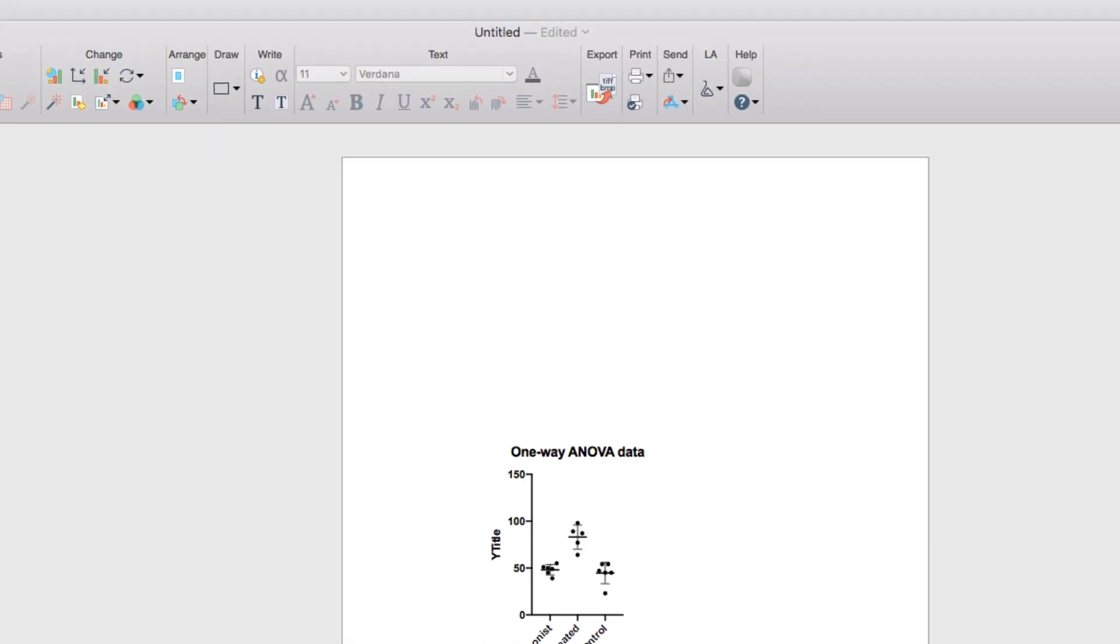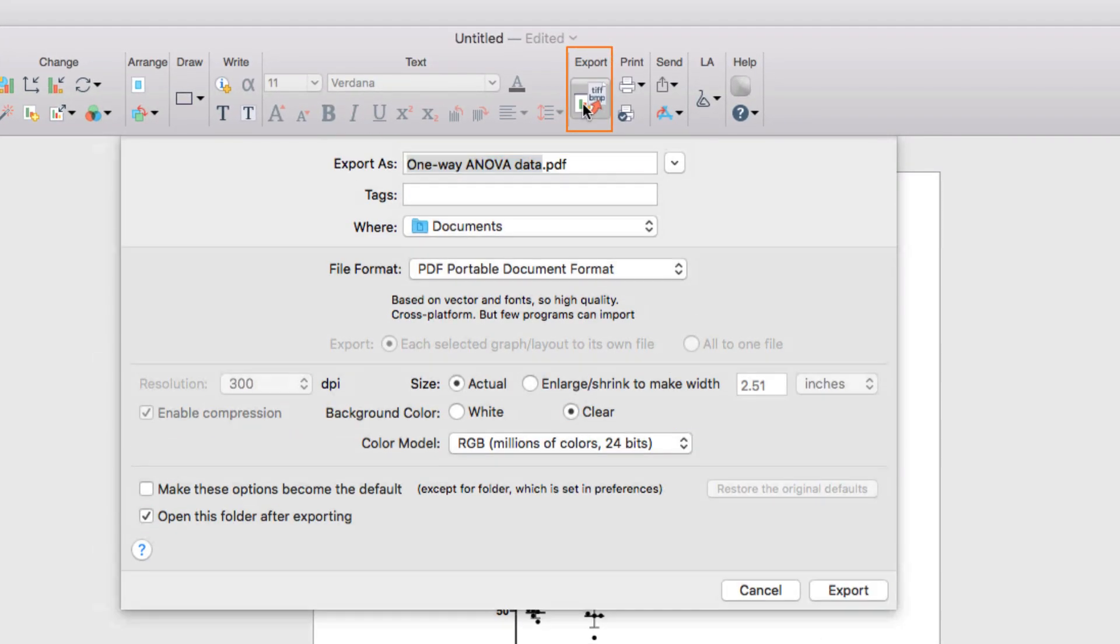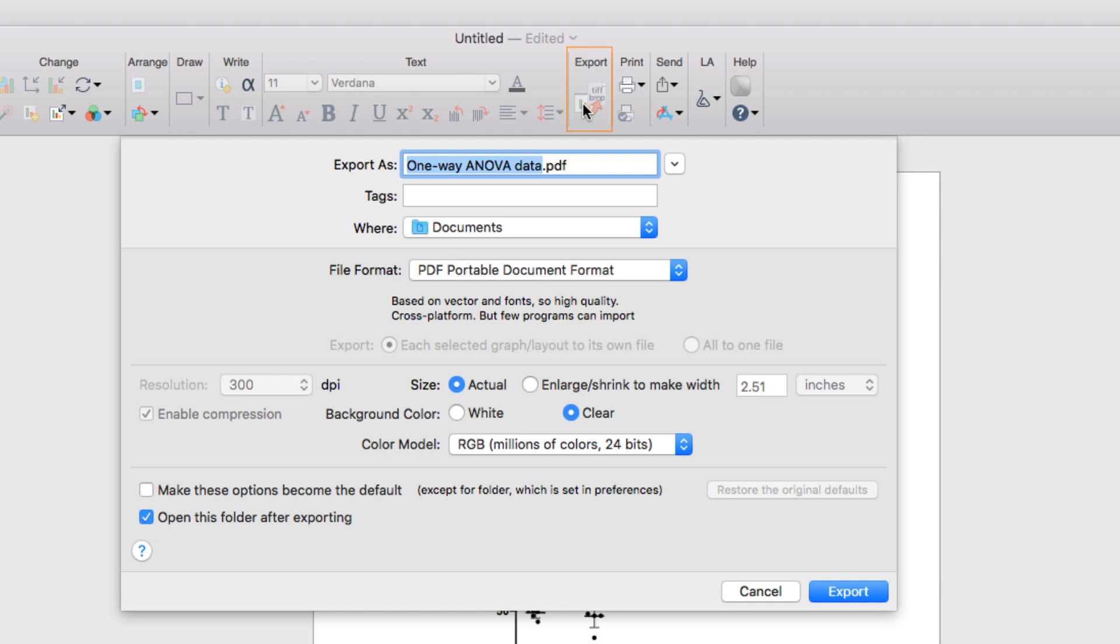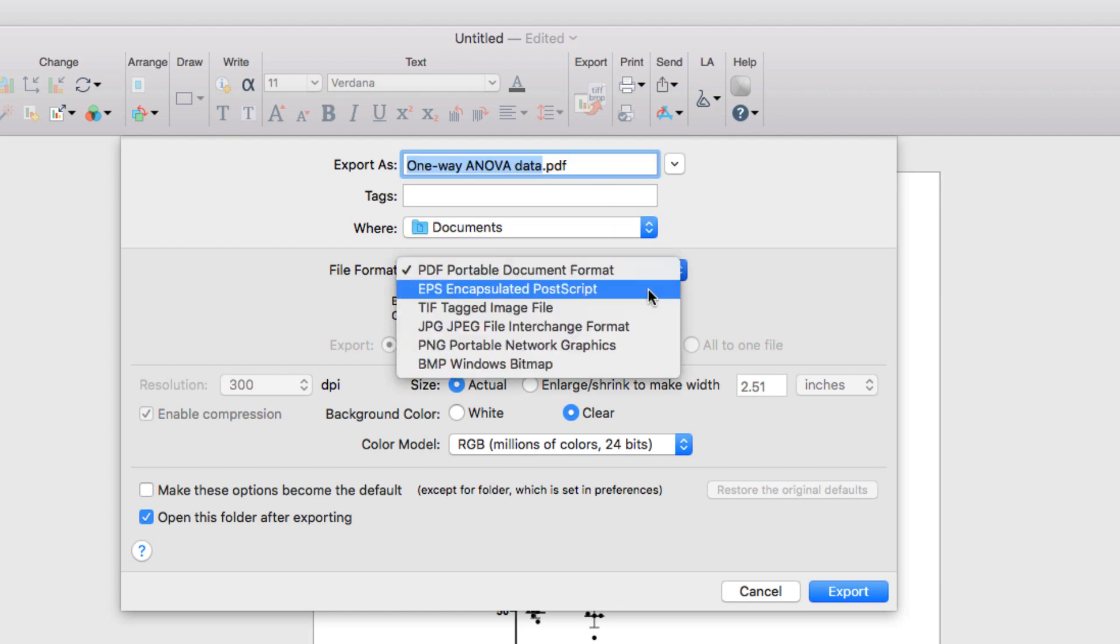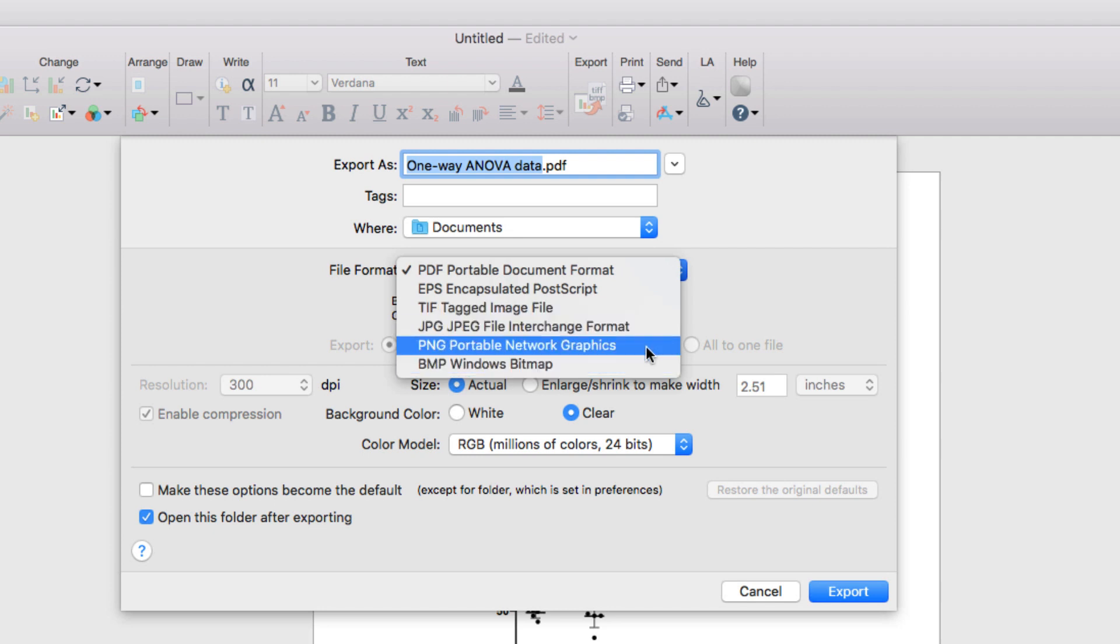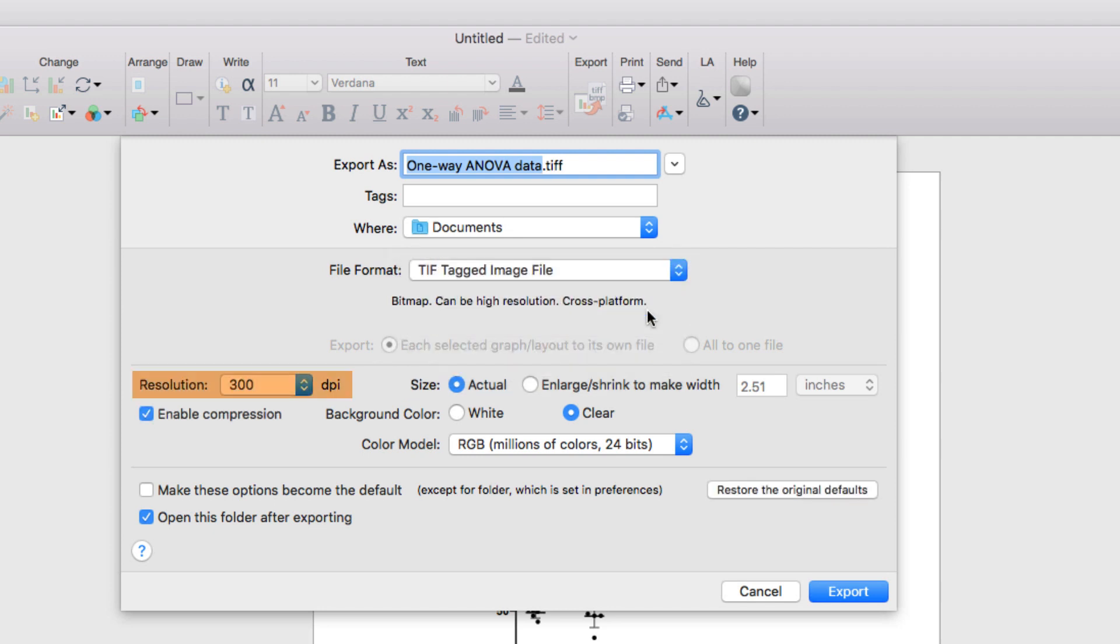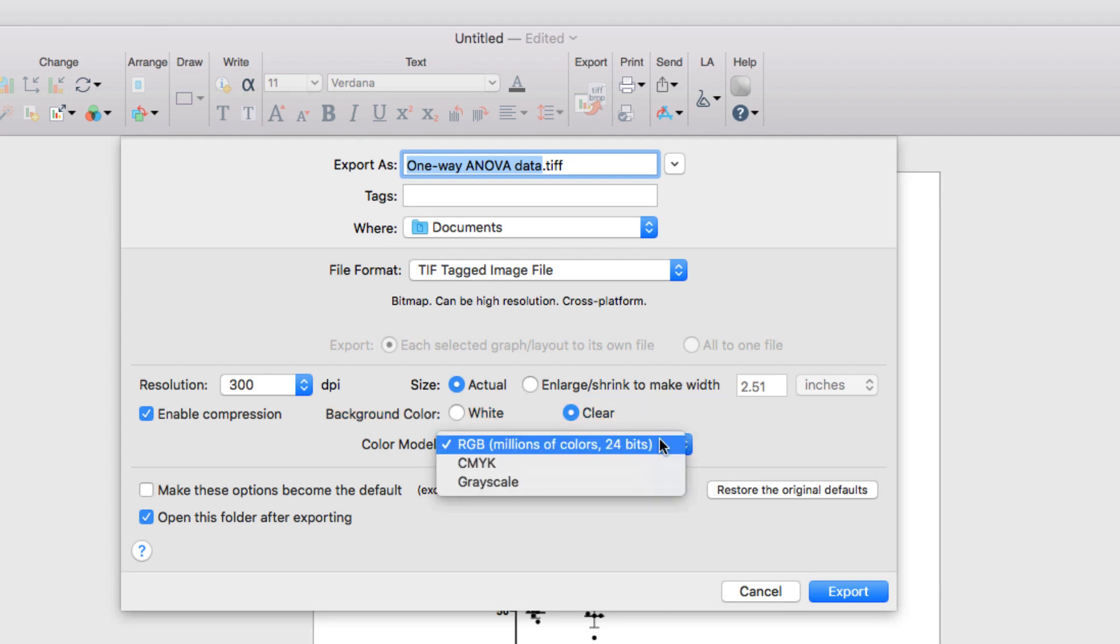Once you have your graph saved the way you like it, you can export it using the Export button in the toolbar. In this dialog, you can assign a name and a file location to save your file, choose the type of file that you'd like to export, such as a bitmap, a JPEG, or a TIFF, select the resolution that you'd like your file to be saved at, the size of your graph, and also whether you want your background to be white or clear, and your choice of color space including RGB, CMYK, or grayscale.